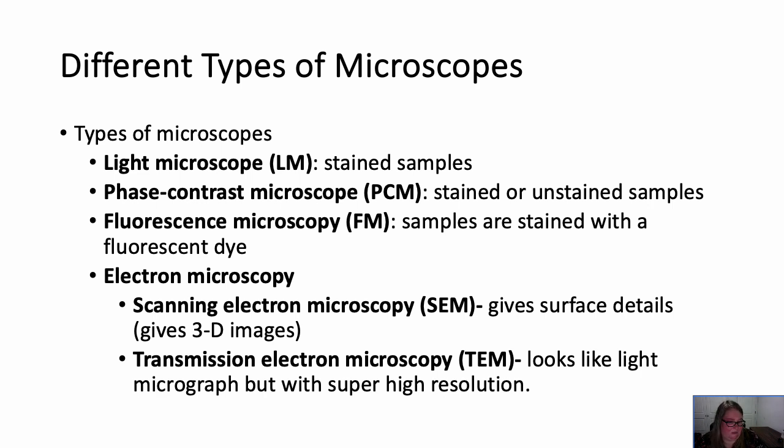This is TEM. And this is going to be very similar to a light micrograph in how it looks, except we're going to have extremely high resolution so we can see a lot more details. In fact, we can see so many details, we're going to actually start to see the parts or the organelles in the cell.